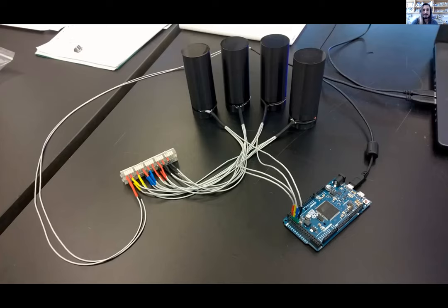And I'd like it to be open source, because there are not that many open source plate readers, and a lot of them assume really tremendous amounts of electronics costs. Few people are actually spinning their own boards. So I'd like this to be a nice open source project where people can actually do high throughput research as an amateur. And one of the most important tools in high throughput research is a plate reader.